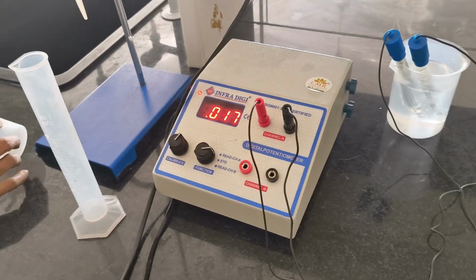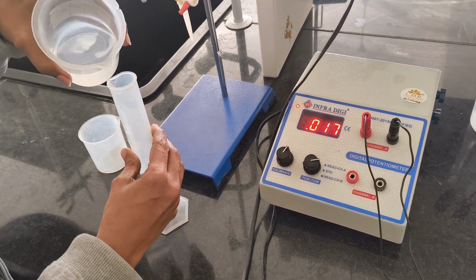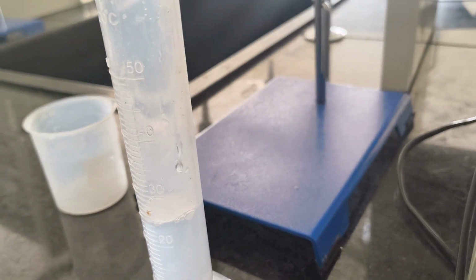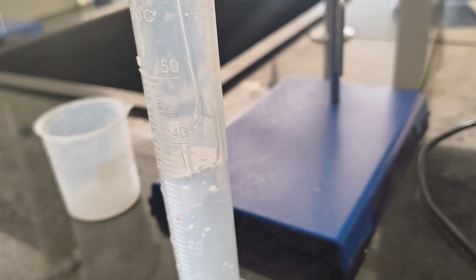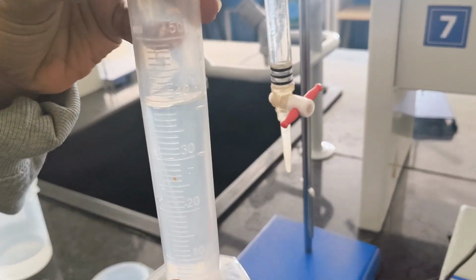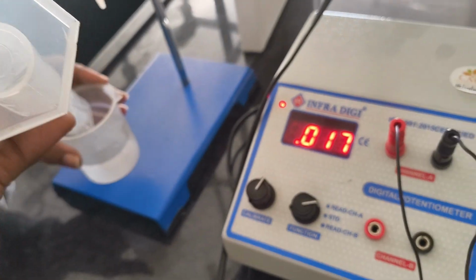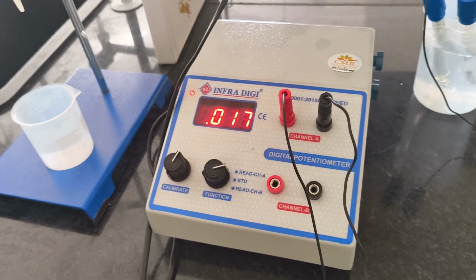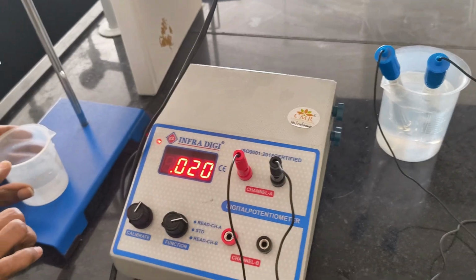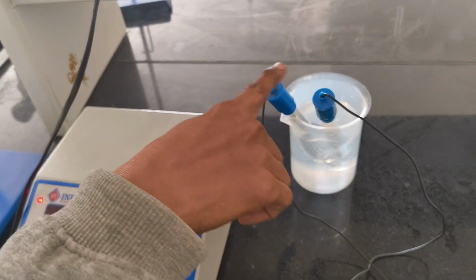Okay. So first we have to start the procedure by taking 40 ml of HCl solution. We take the HCl solution and measure 40 ml of it. This 40 ml HCl solution is measured and taken in a beaker. Into this beaker we have to place the electrodes. This digital potentiometer is connected with the two electrodes.